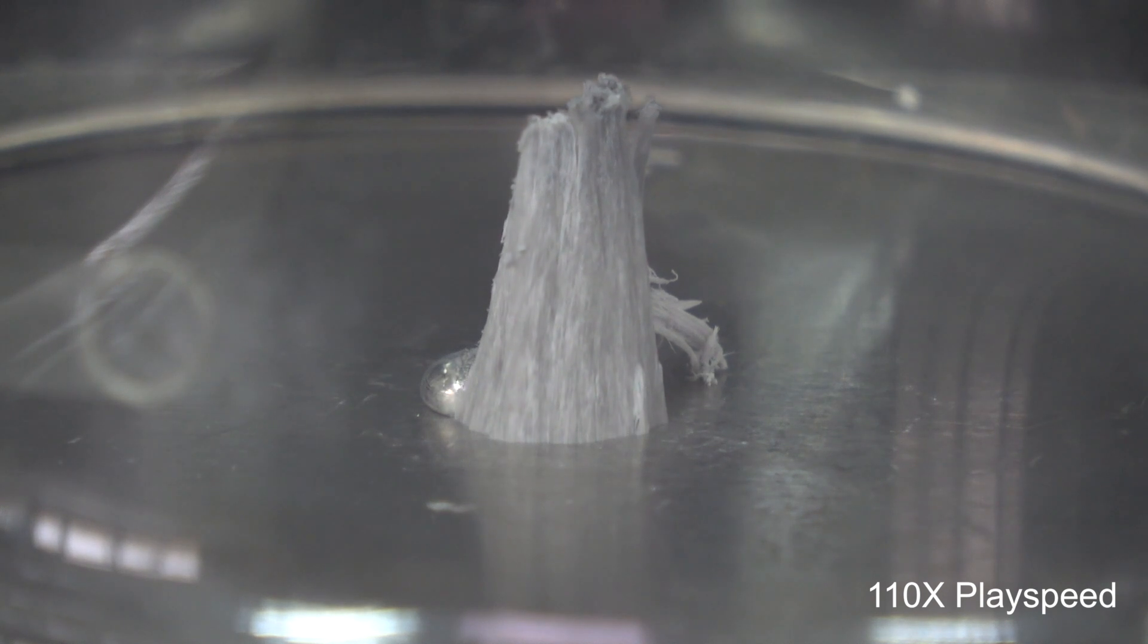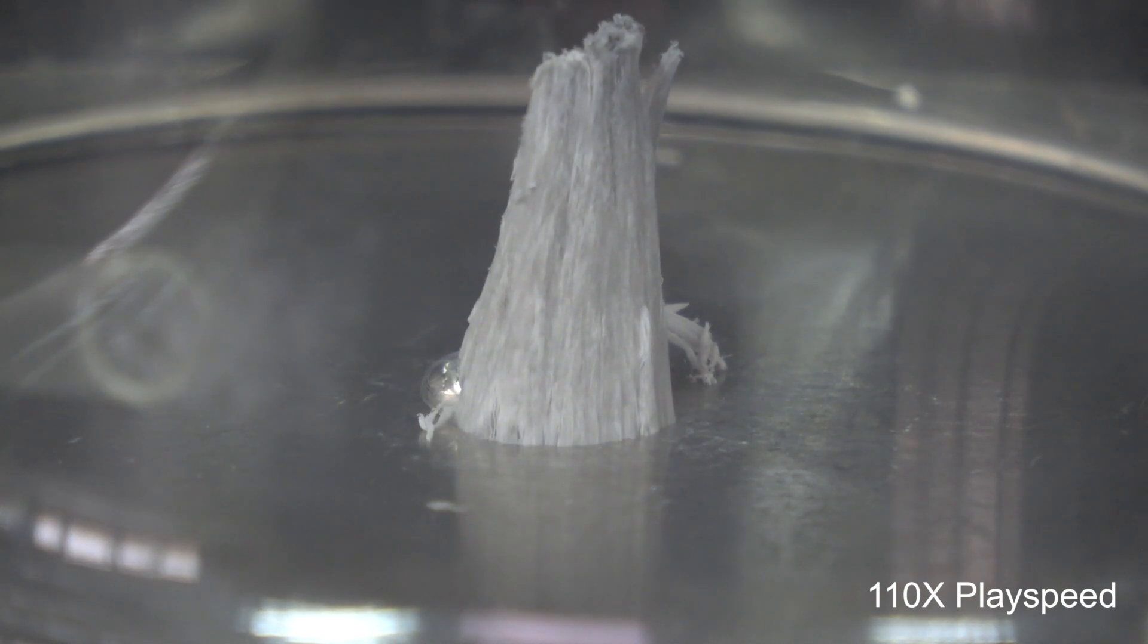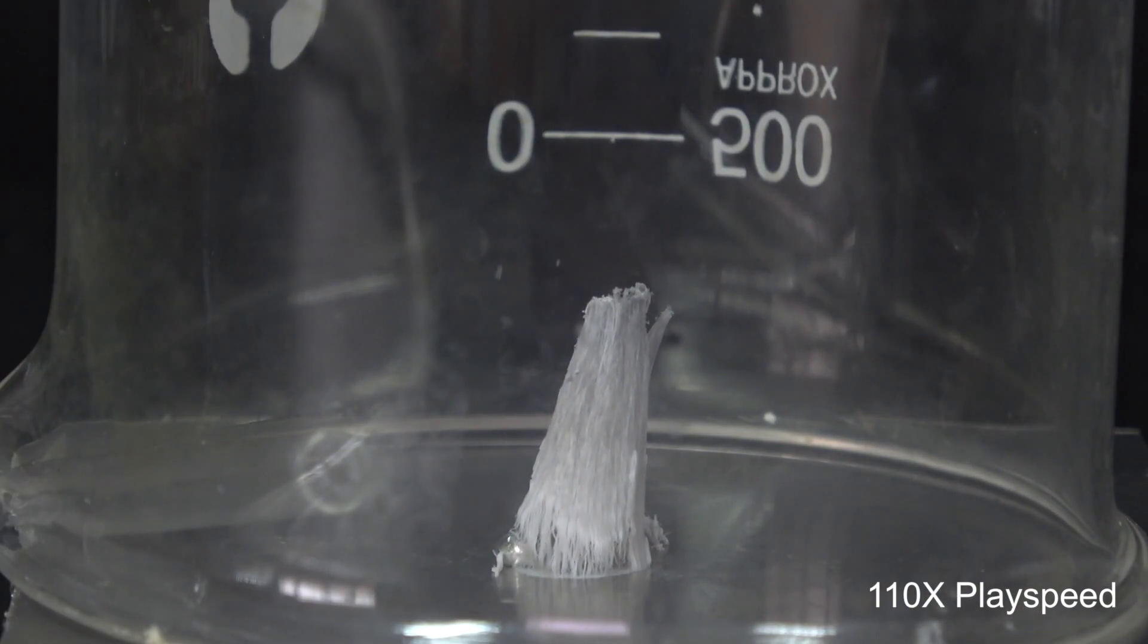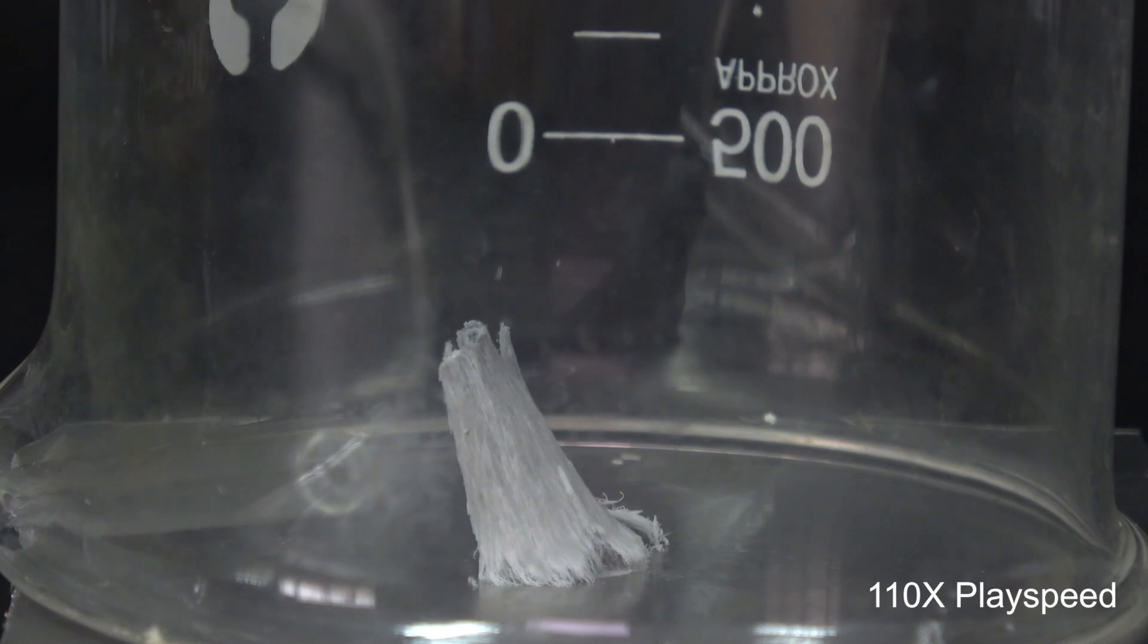Since the mercury was pushed aside and was no longer in direct contact with fresh aluminum, no more amalgam could be formed, thus the foundation of the fiber became weaker and weaker. Eventually, it collapsed upon its own weight.